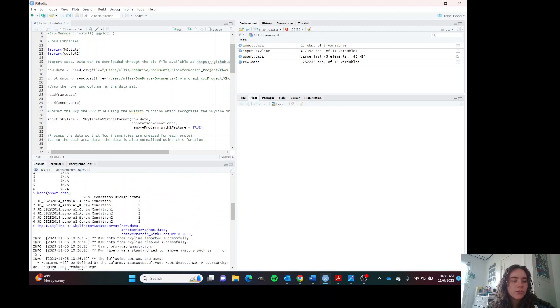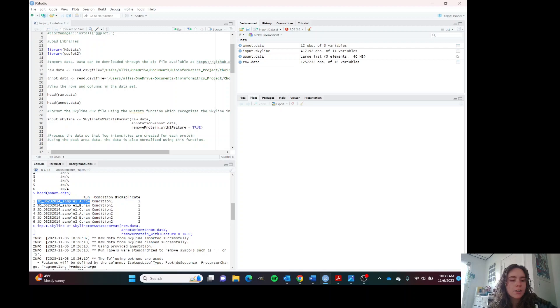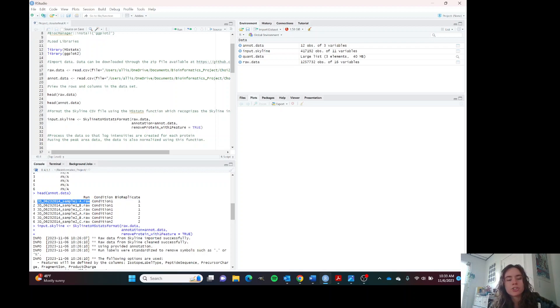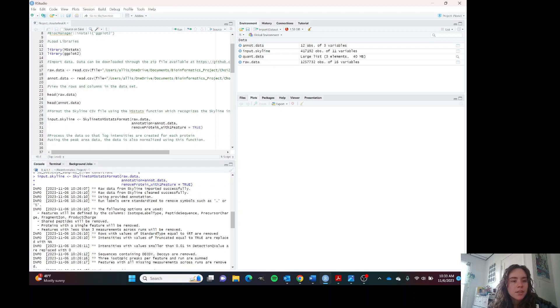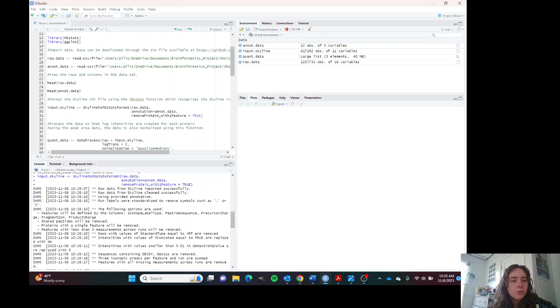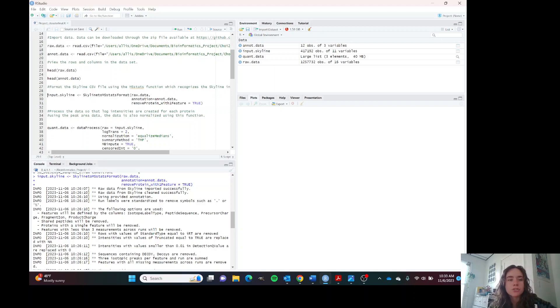The annotation file is just created by the researcher. You input the name of the file of the run and assign it the condition and the replicate so that we can now process and format the data using these two files. This is what we will use to format our data so that MSStats can actually read it.